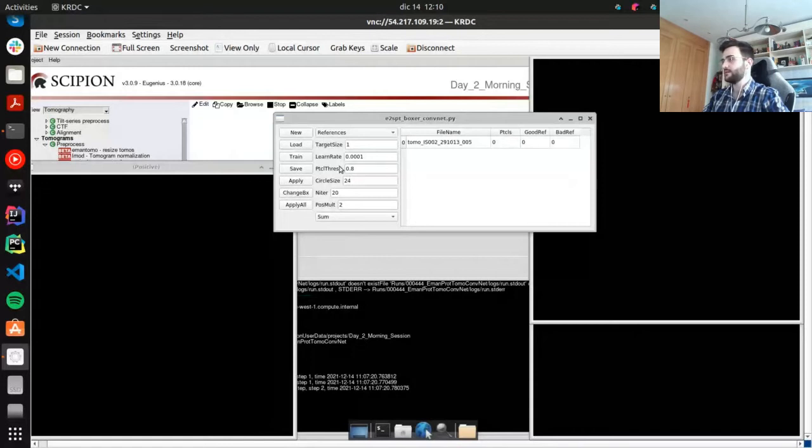In general, I haven't touched it to pick, but well, it's available. Target size: 1 angstrom, 1 pixel. I don't really know, EMAN doesn't explain the units of this parameter. It has to do with the size of a blob. EMAN is going to convolve this image with a Gaussian and make the particle a blob. So it's the size of the blob, but they don't explain if that size is in pixels or in angstroms. I don't know. Sorry.